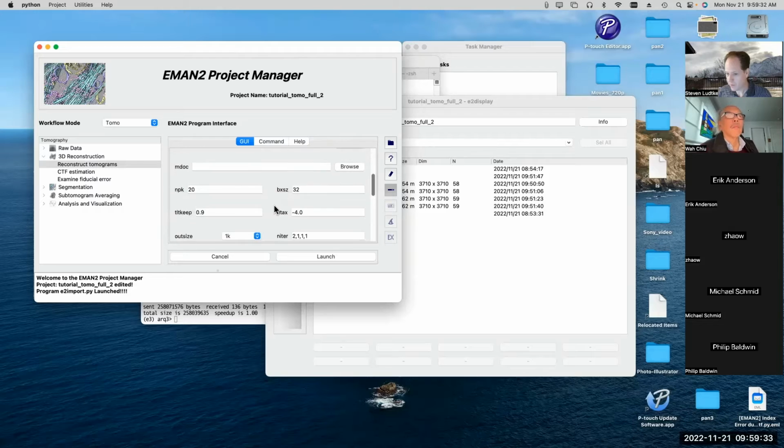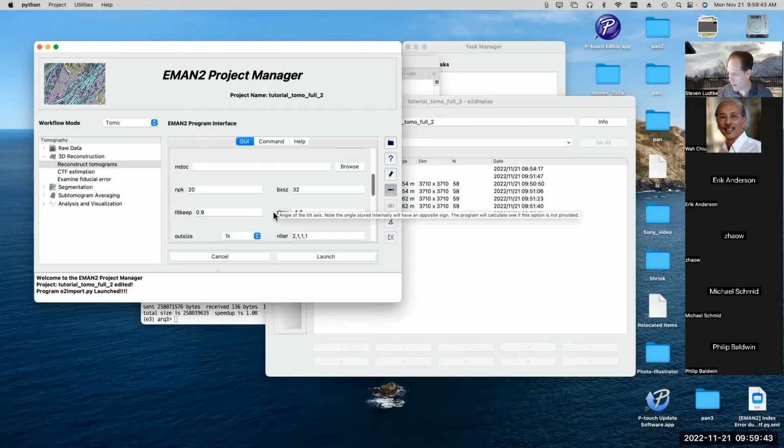We use a term different than fiducial because when you say fiducial, people are usually referring to gold fiducials, which you specifically added to the physical specimen to act as markers when you tilt the specimen. So we're not talking about the need for specific fiducial markers in the specimen. When you use this tomographic reconstruction scheme, it's basically using any high contrast features that it finds in the image as landmarks.